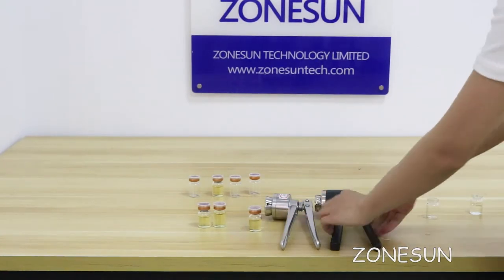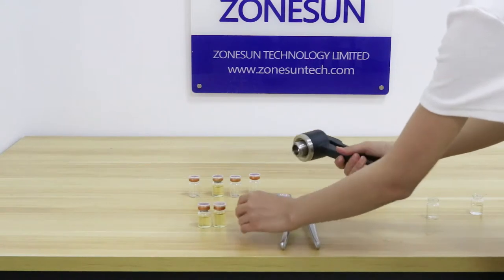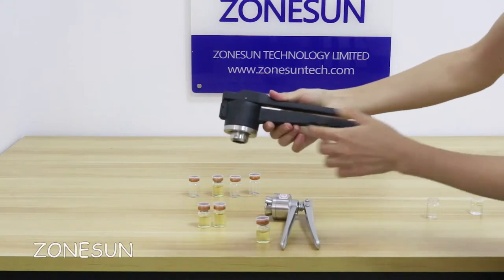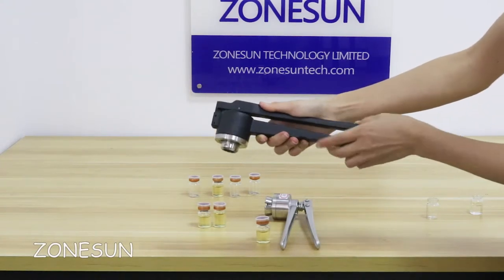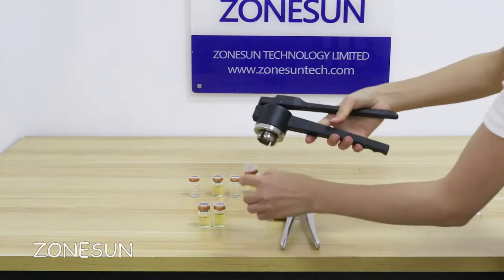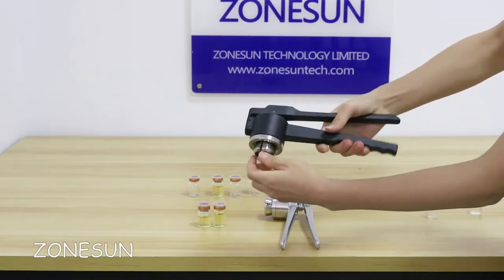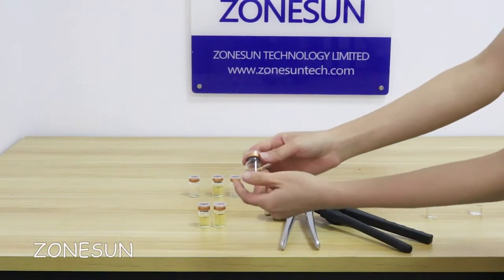Now I will show you how to use it. Please press this handle and this handle — when you press it, it is barely tight. Then use the tool to press. See, this is perfect.